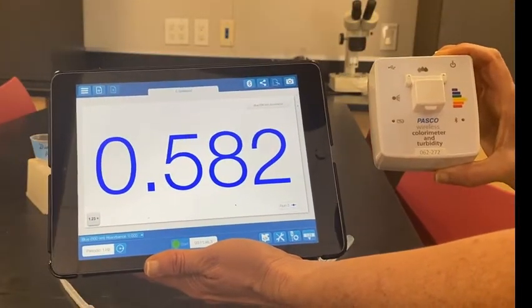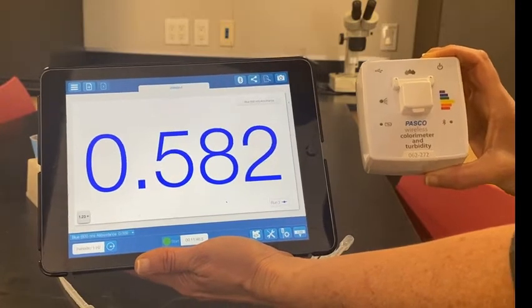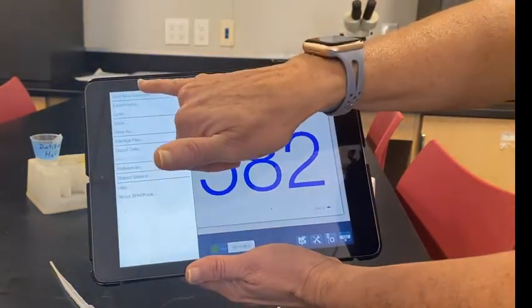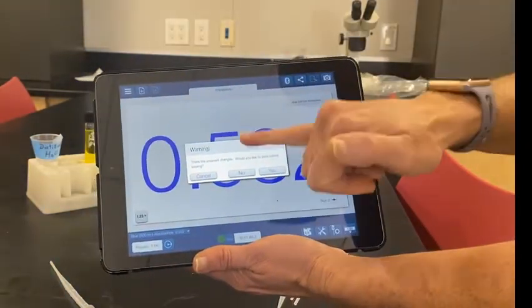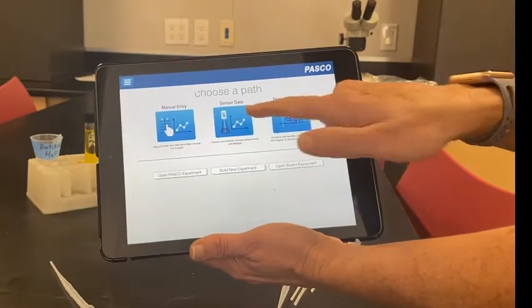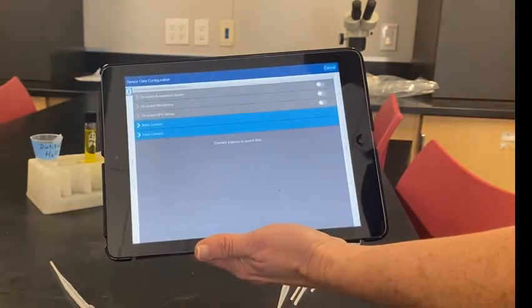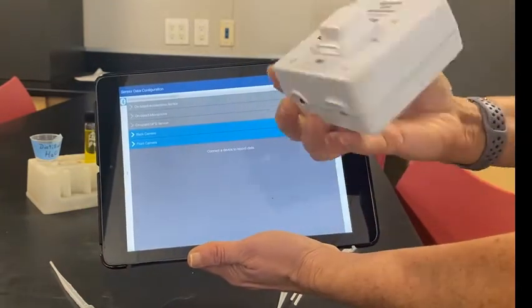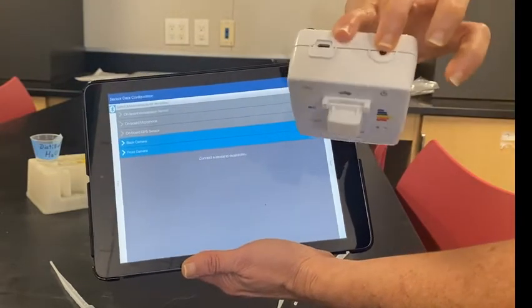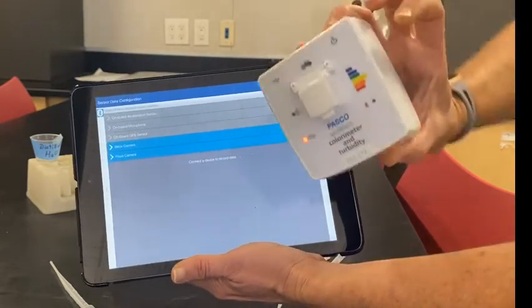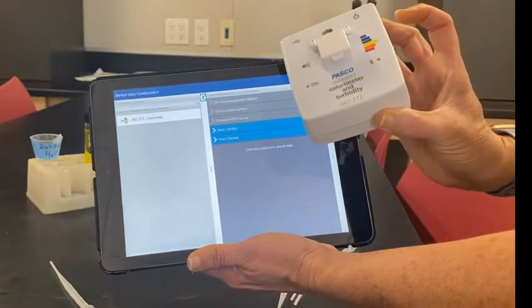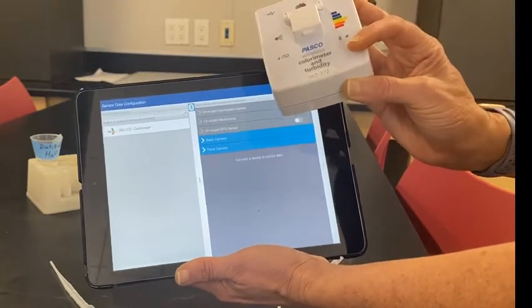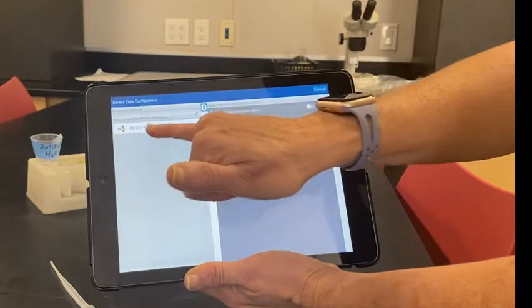Here is the colorimeter and the iPad that will read the colorimeter readings for you. When you get the iPad, click on 'Start New Experiment' — you don't want to save any changes from the old one. Go to sensor data and give it a second. If it's not reading, it's because you need to turn the power on. The power button is in the upper corner — just hold it down, the light will flash, and then they will find each other via Bluetooth. The serial number on the colorimeter matches the one on the iPad; simply click on it and it will connect.